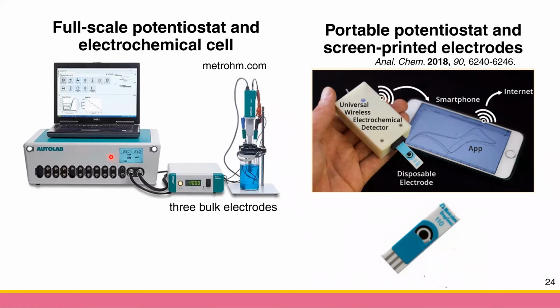And today you don't directly work with the potentiostat, but you connect it with a computer or laptop, and then you control and record the electrical quantities through your program, which is very convenient.